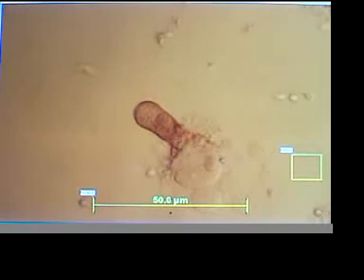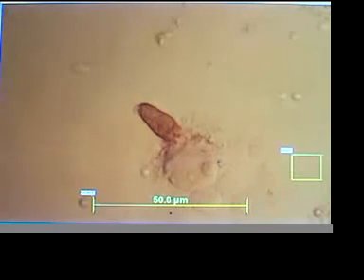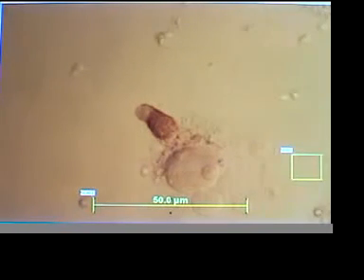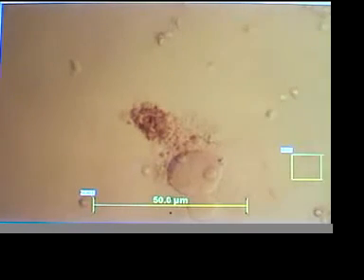This is a real-time devitalization of a Blepharisma using a plasma light, which is sitting about 5 inches away from the center of the slide. And here we've added a little touch of red filter. Here we see some action here. The end of the process. Explosion on top. Many spheres of many sizes formed. Look over here, you'll see tiny organisms swimming around. So he's not dehydrated, he's not been boiled, he's not been ultrasonically zapped.